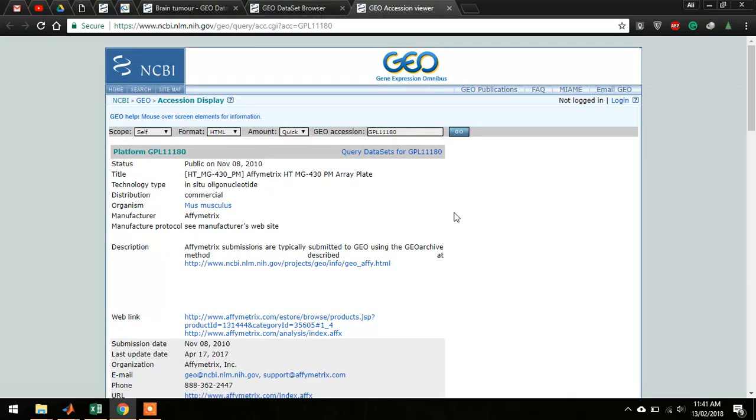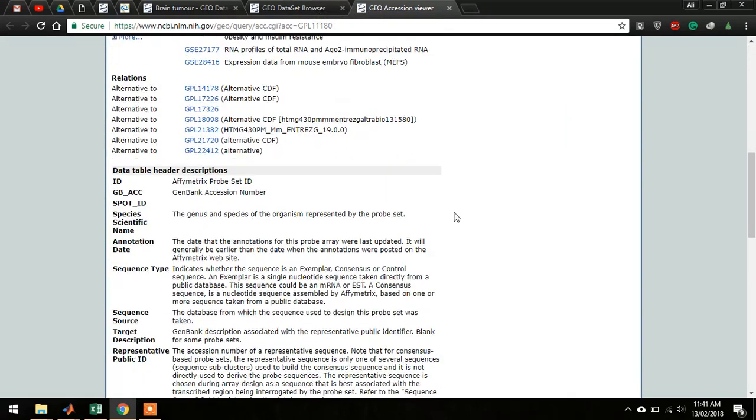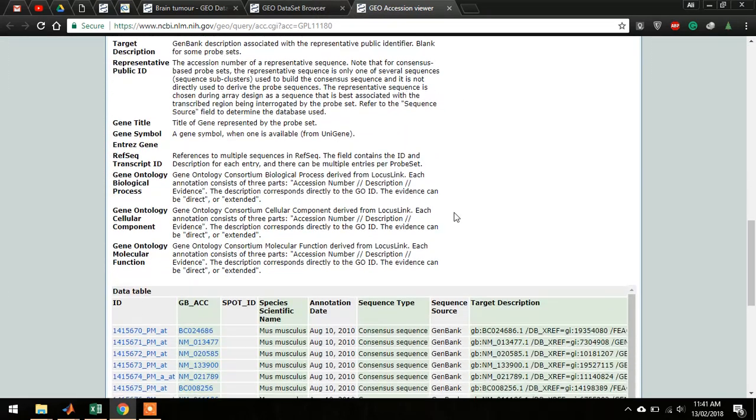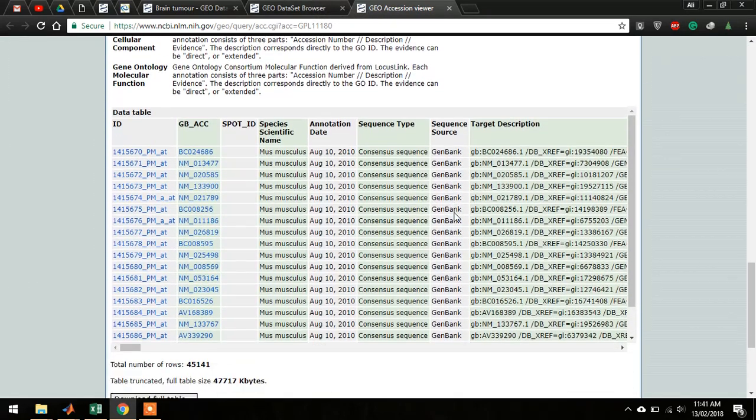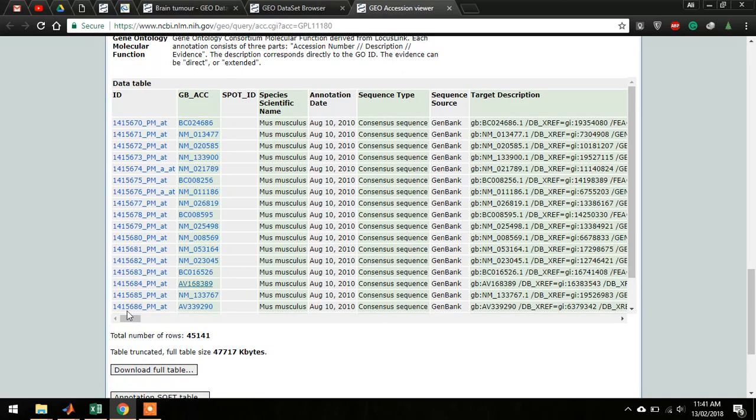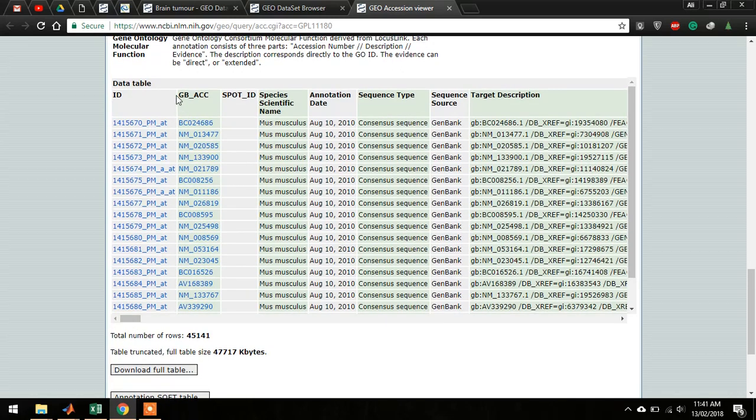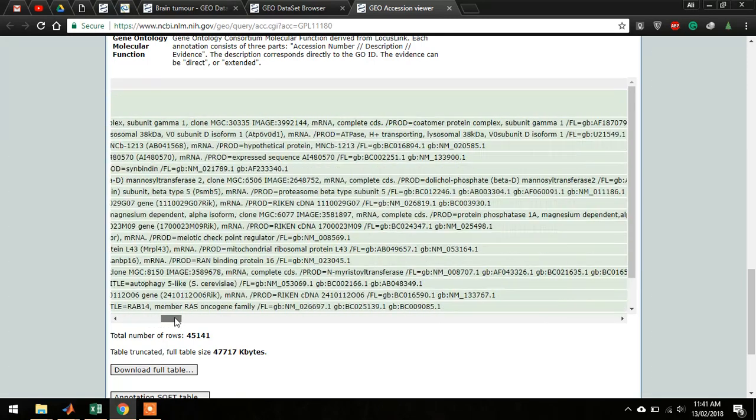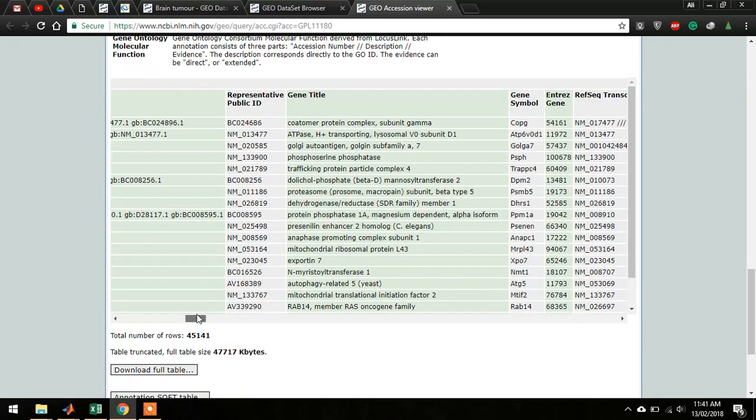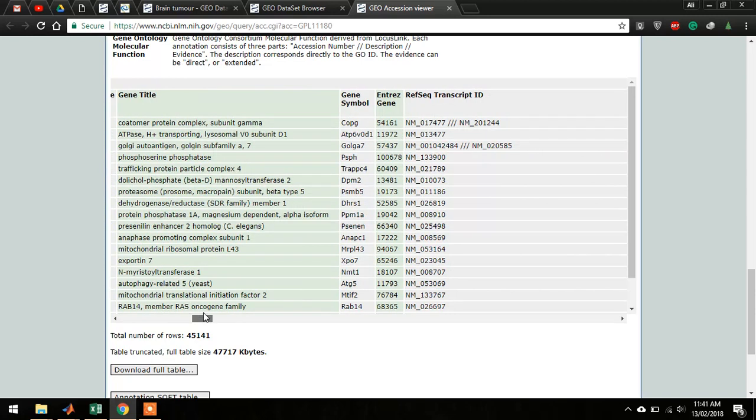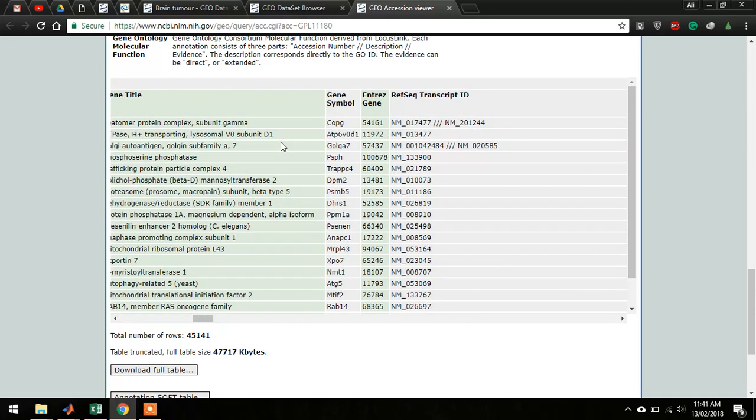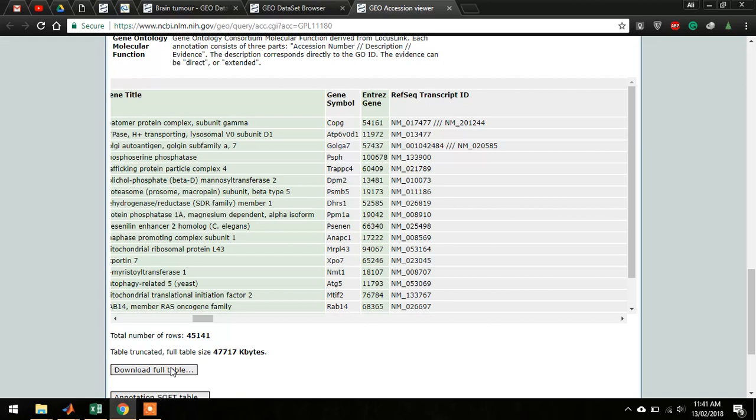Once this is open, you have to see the table which will contain all the data. Now you have to find a column where there are gene symbols. Here we have the gene symbol, so this table is perfectly fine. We can download this table.